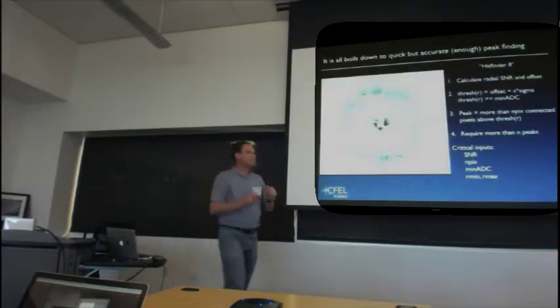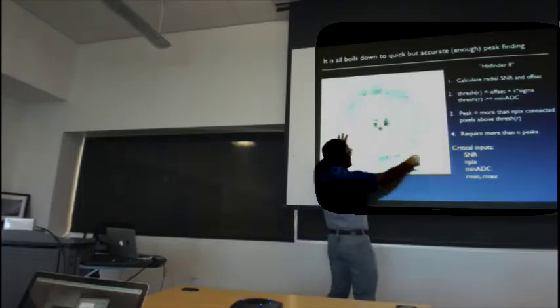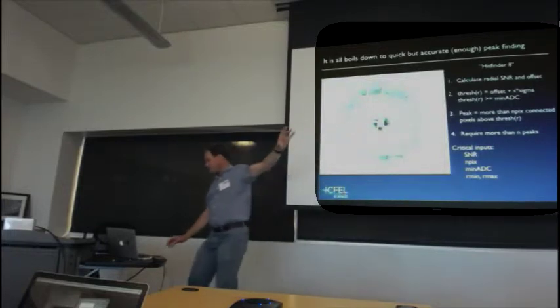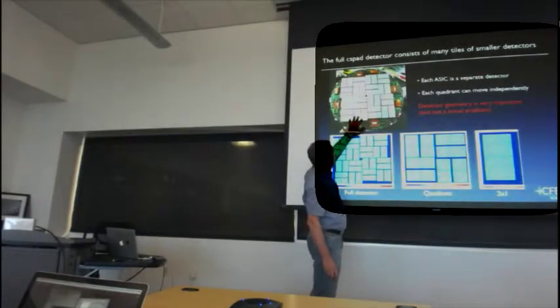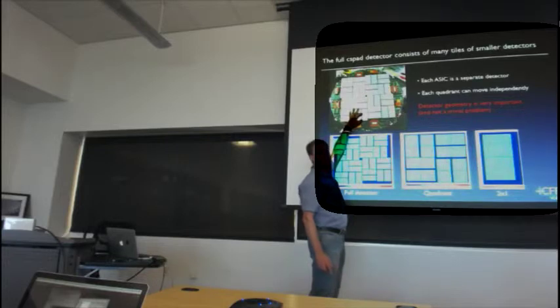The other thing, for the majority of you who've written your own auto-indexing software, when you project these onto these reciprocal lattices, it really matters where these detectors are located. Okay. So now we get into the curly aspect of geometry. Because the detector is put together like this. Each of these elements is lithographically fabricated. You can trust where the pixels are relative to each other on each of these.